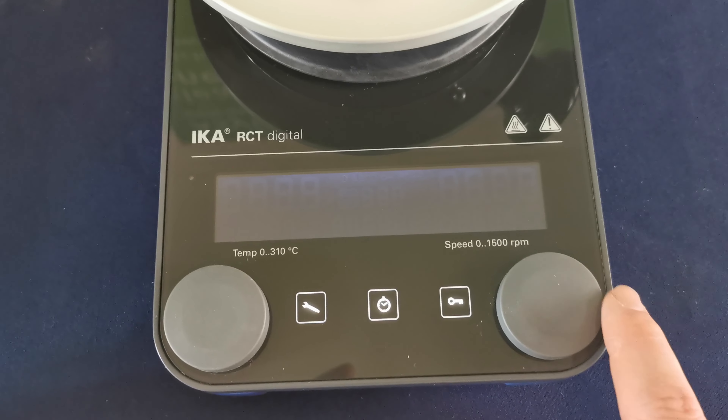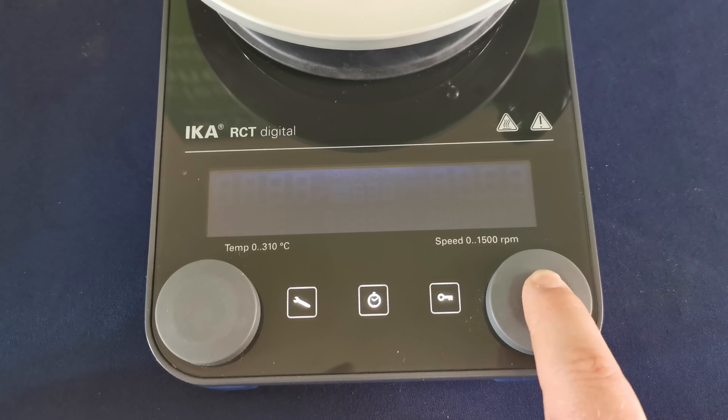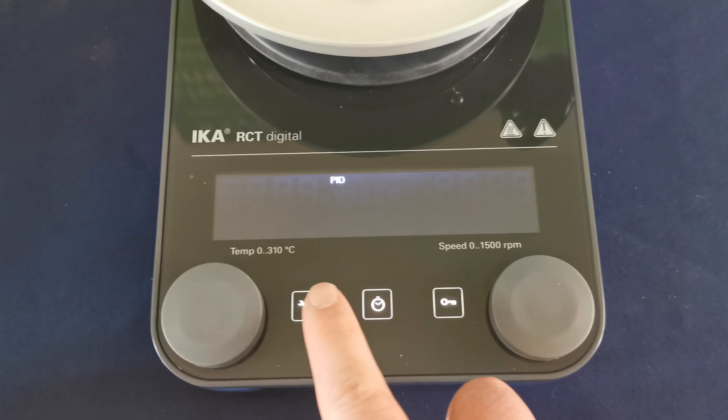Click, and you can now change that to PID. Click to set it, and click the settings to exit. Now this hotplate is in PID mode.